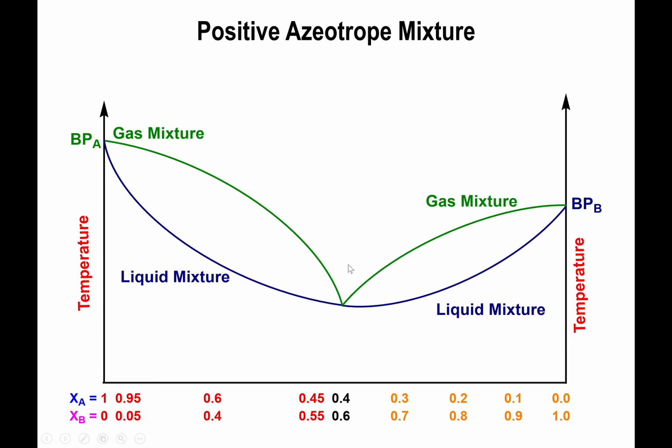And if you look at the graph here, what you will notice is that our lower boundary, upper boundary buffer zone is actually composed of two segments, right? You have the left segment right here and the right segment, and there is a lower limit that connects the two together. Azeotropes are basically substances that will end up reaching a maximum or a minimum in the amount of content that you can have of substance A and substance B. But you don't necessarily separate them completely.